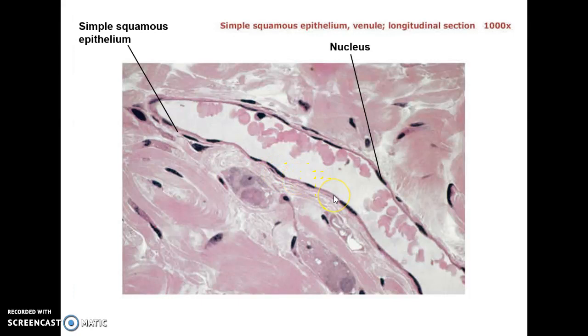Remember, these are squashed, flattened cells, but you're seeing them cut end-on. That's why they look like a very thin cell. So a really nice view of all these simple squamous epithelium cells.